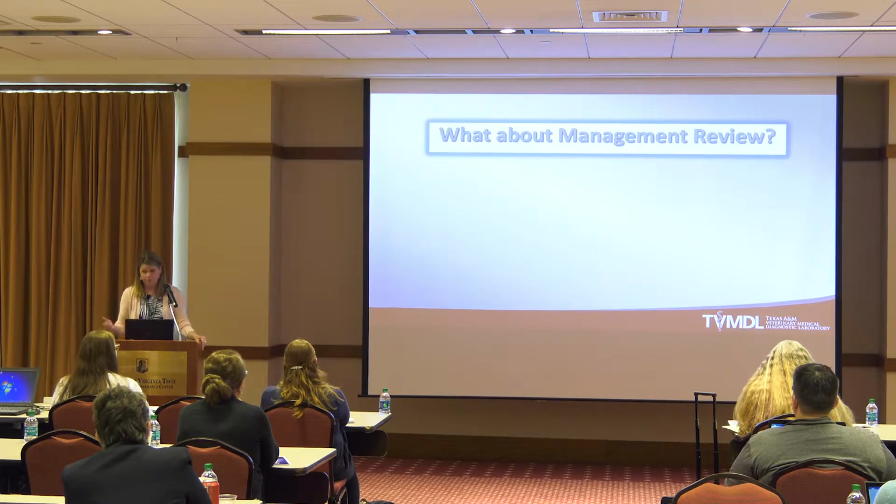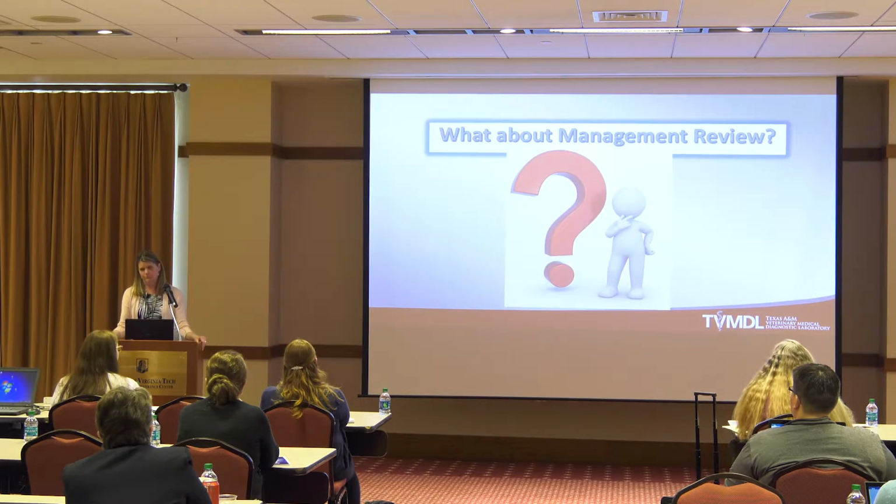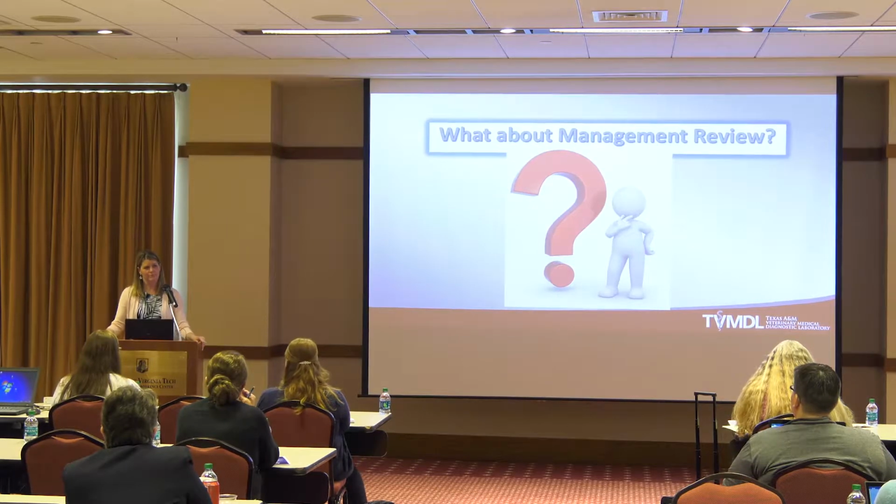One of our biggest questions was, what about management review? Our management review process was one that we had developed with our system with the Access databases. It was one that our management actually liked. It was a gradual process in developing what they wanted to see and what they wanted presented to them. We had to figure out how we're going to do that with Qualtrax, because we went from Access databases that very easily went into Excel without a whole lot of data manipulation.